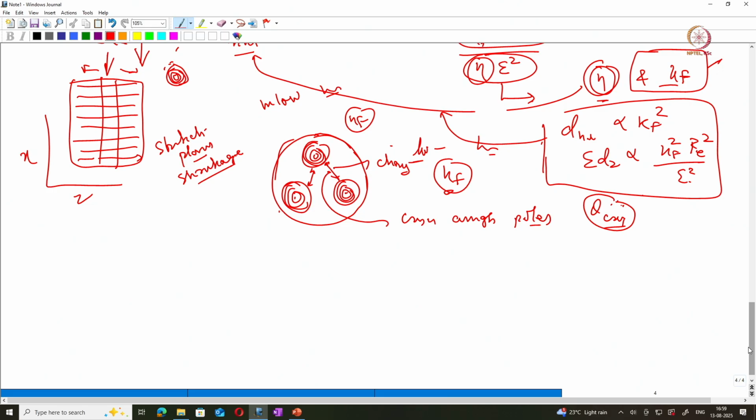For example, in old atom probes where the MCP plates are not so advanced, the detection efficiency is about 30 to 50%, correct? And in recent times it has increased to 57% with the reflectron, and for a straight path it can go up to 72% detection efficiency.